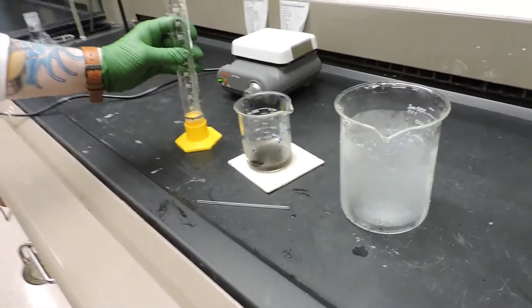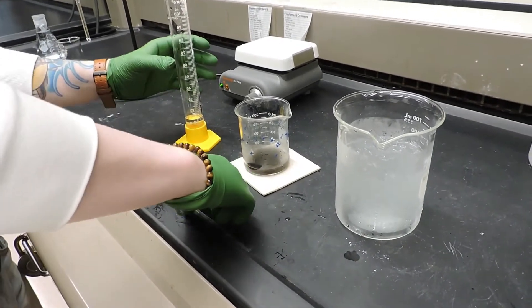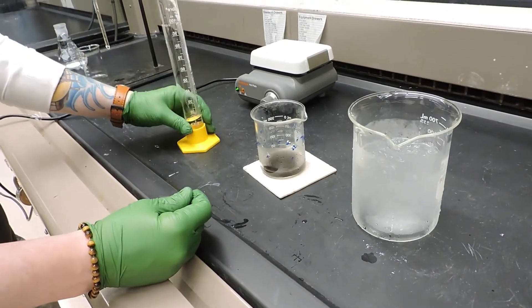Now that we've removed the beaker from the ice, we're just going to add 20 milliliters of 9 molar sulfuric acid very carefully and slowly.